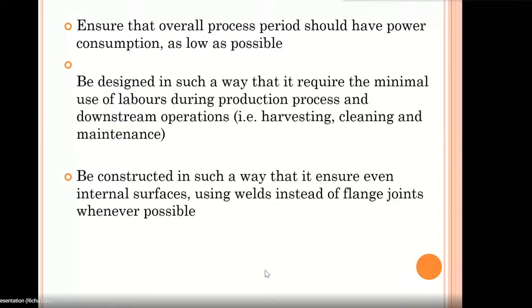Okay. The last point is that when the body of the fermenter is constructed, as I said, glass or stainless steel will be used. Whether it is glass or stainless steel, a single sheet cannot be used. If we talk about stainless steel, we have to use multiple sheets of steel, for example two or more. Now how are we supposed to join these two sheets? There are two options. Either we can use screws while making the body of the fermenter, or we can do welding.